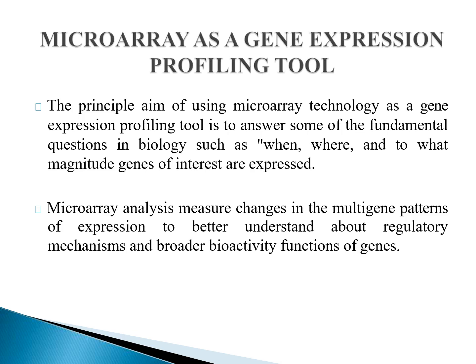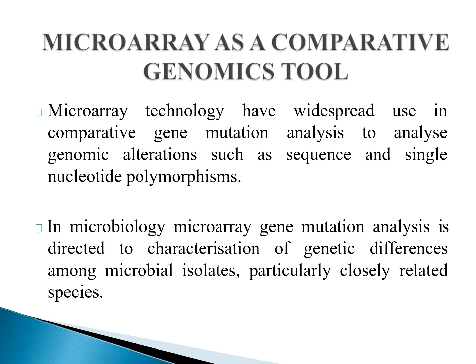Then microarray analysis measures changes in multi-gene patterns of expression to better understand the regulatory mechanism and broader bioactivity function of the gene. Then, microarray as a comparative genomics tool. You know that in the population, single nucleotide polymorphism, or polymorphic DNA, is present. In order to analyze or compare this polymorphic DNA, we can use DNA microarray technology. It has widespread use in comparative gene mutation analysis to analyze genomic alterations such as sequence and single nucleotide polymorphism.